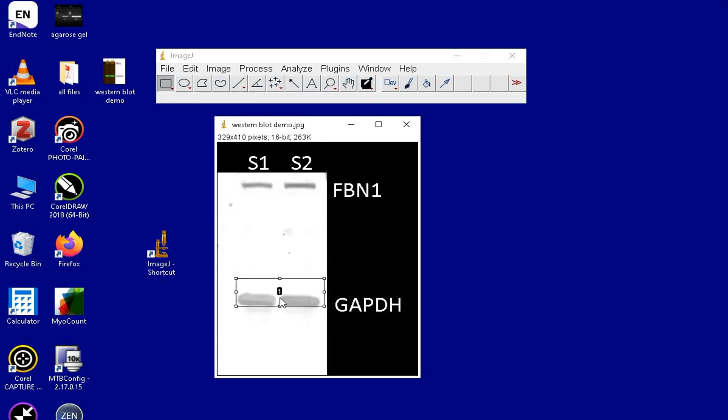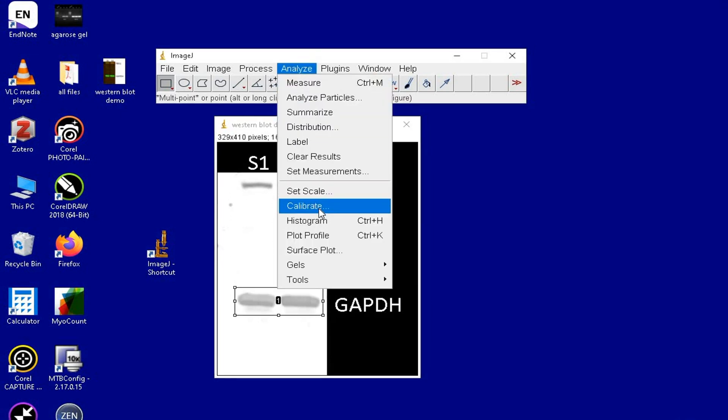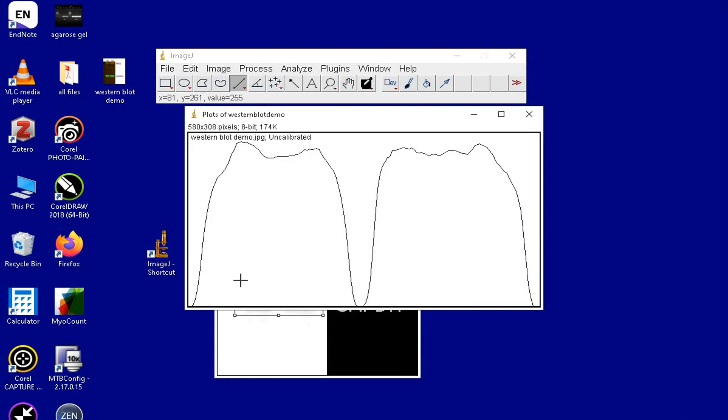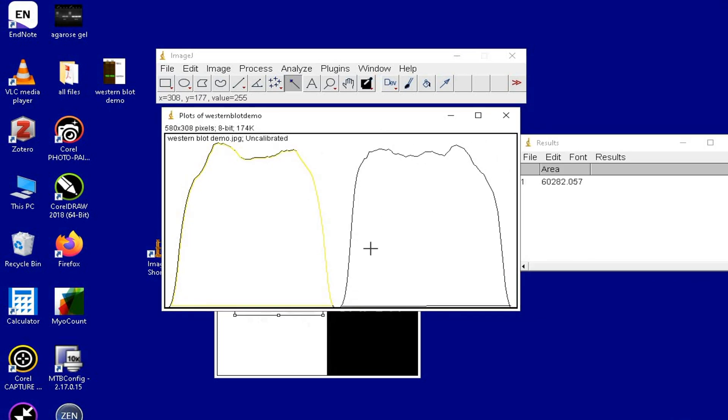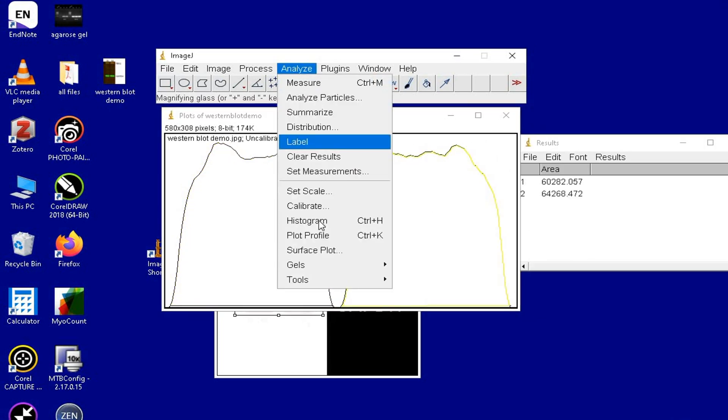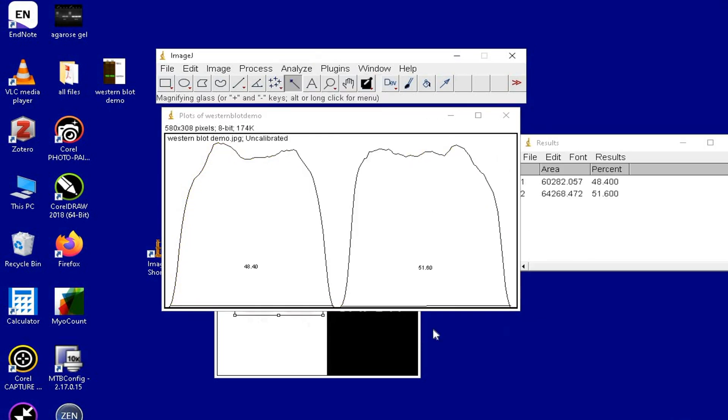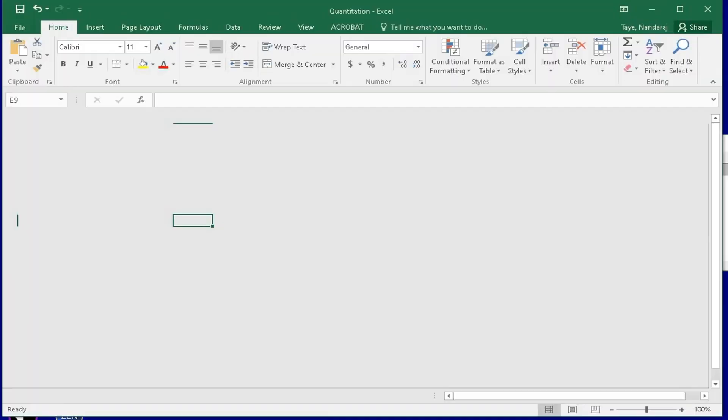Next, we will repeat the procedure for the housekeeping gene GAPDH in a similar way to calculate its percentage area intensity. Once the results are obtained, copy the entire data and paste it in the Excel file.